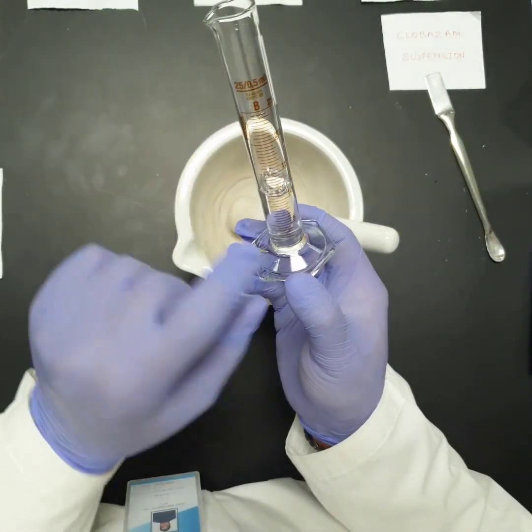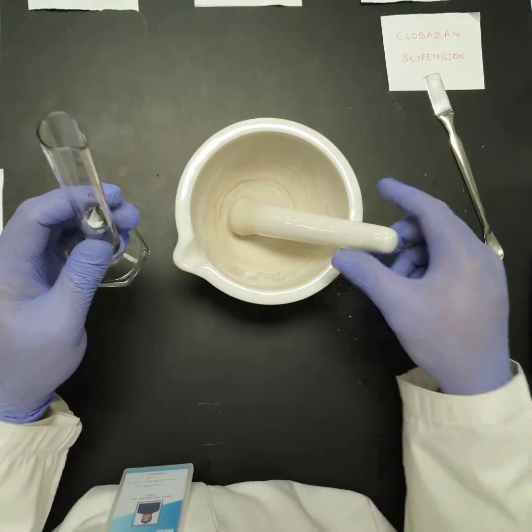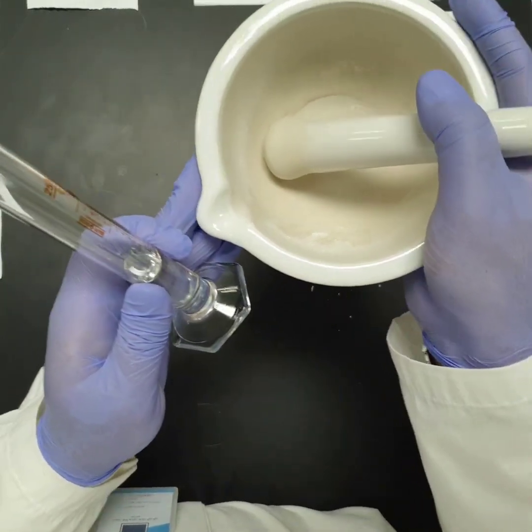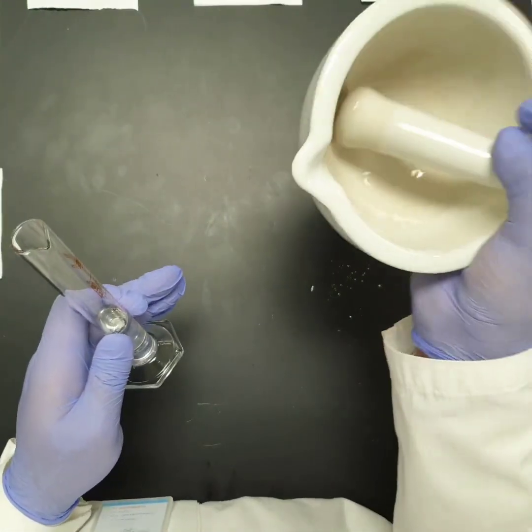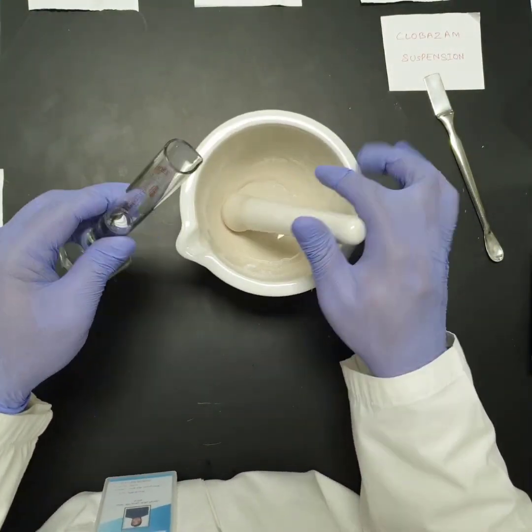This syrup is 12.5 ml. So we have to add a little amount of syrup so that the mortar contents will become pourable. Now as you can see, it is in a semi-solid form. We cannot pour it. If I overturn the mortar, nothing will come out. So I have to make it pourable. I have to make it liquid.